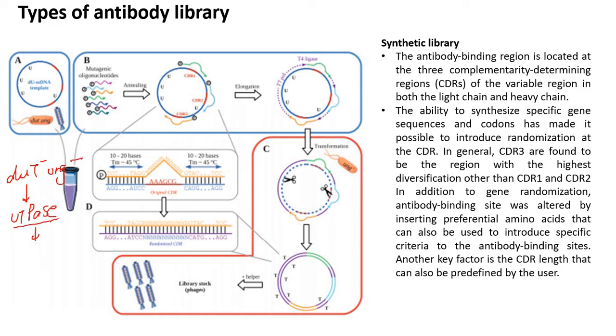Because of the inactivation of this, dUTP is going to accumulate, meaning uracil is going to accumulate. So at some point of the replication, you will find there are U's, and because this is UNG negative, this U is not going to be removed from the strand. So this bacteria has the vector, and this vector has U instead of T.